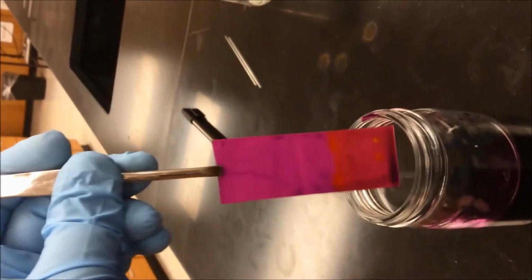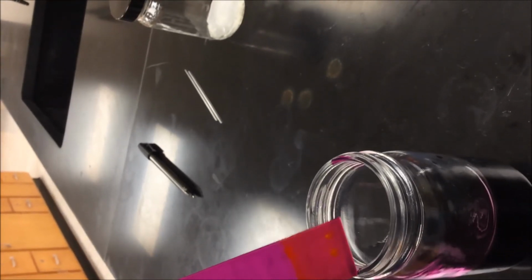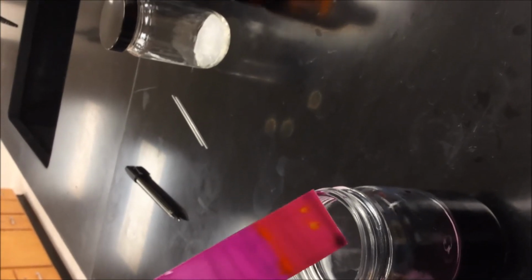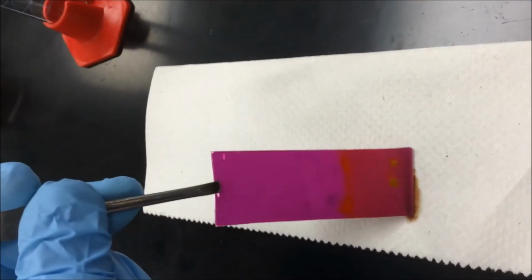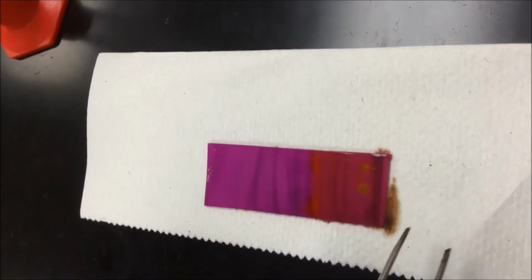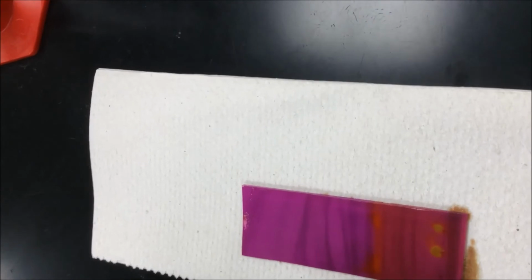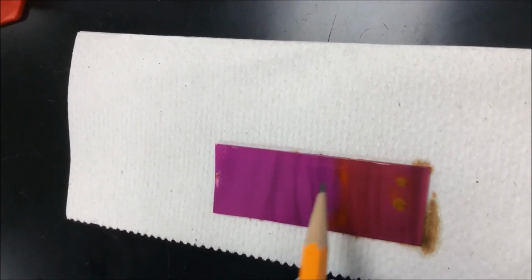Look at that. You can see, is there a paper towel? If I just remove the excess, you hopefully can see that the first spot, right here, which was the ortho, went all the way up till this point. There is nothing in here. We only have a bottom spot, and the third one is the co-spot, which contains both.